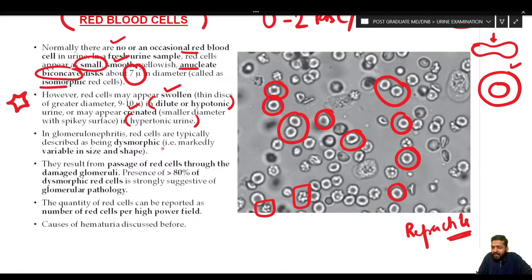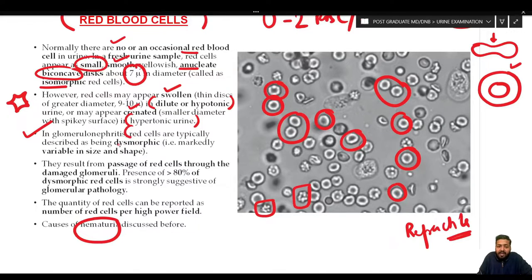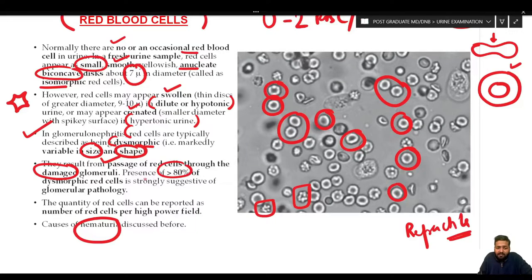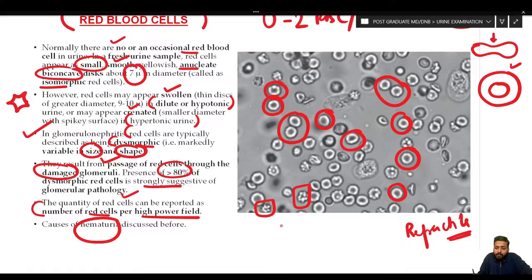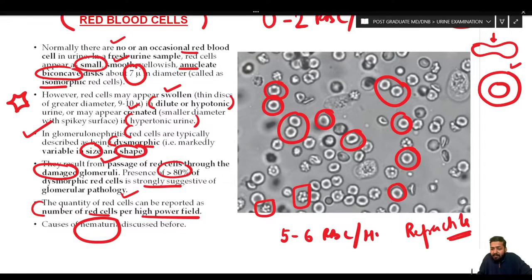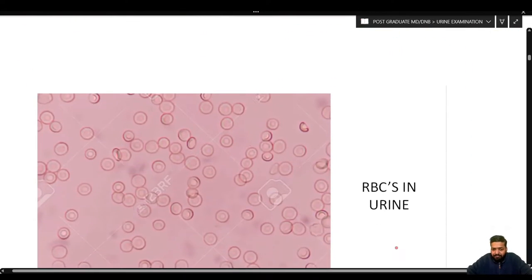In glomerulonephritis, the red cells are typically described as dysmorphic — they vary markedly in size and shape due to passage through damaged glomeruli. Presence of more than 80% dysmorphic red cells is strongly suggestive of glomerular pathology. The quantity of red cells is reported as number per high power field, for example 'five to six RBCs per high power field.'